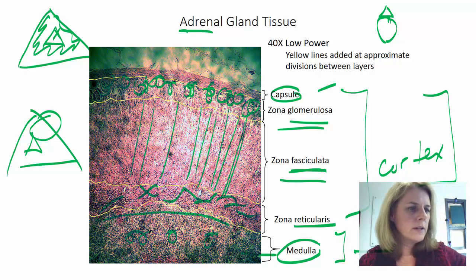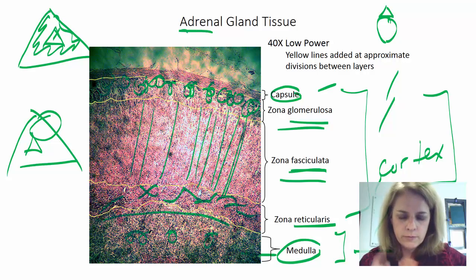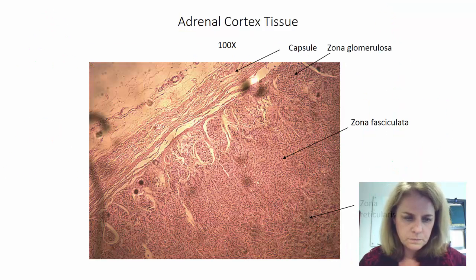I haven't told you what it does. Go look it up. Each one of these things that I'm talking about, the 3 zones and the medulla, all do something hormonal. It's on you to figure out what they do.